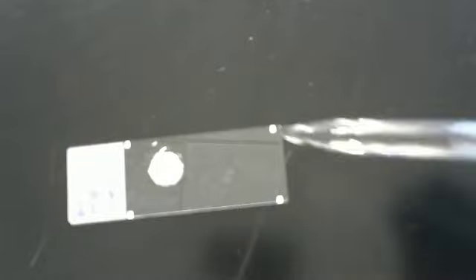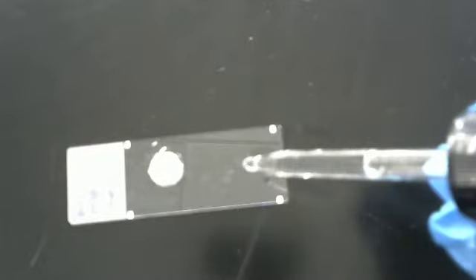Compare that to the area next to it where we don't have it, it's just plain. That white area's bubbles, that is the indication of a positive test.